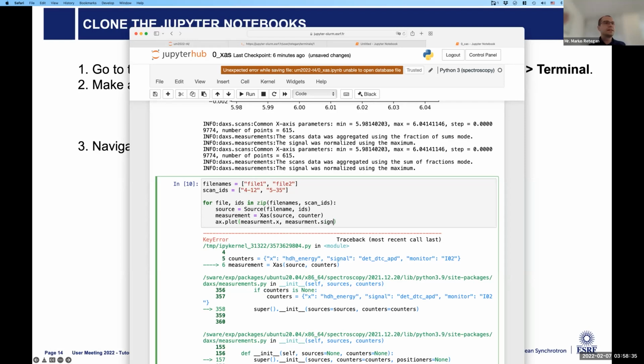So is this answering a little bit your question? Yeah, but the syntax is, let's say, very difficult. Yes, I know, and I agree that if you're used to working with it, but if you just come once and try to do that, and then you have to remember all these loops and everything, I think it's complex. Yes, think of it from this perspective.